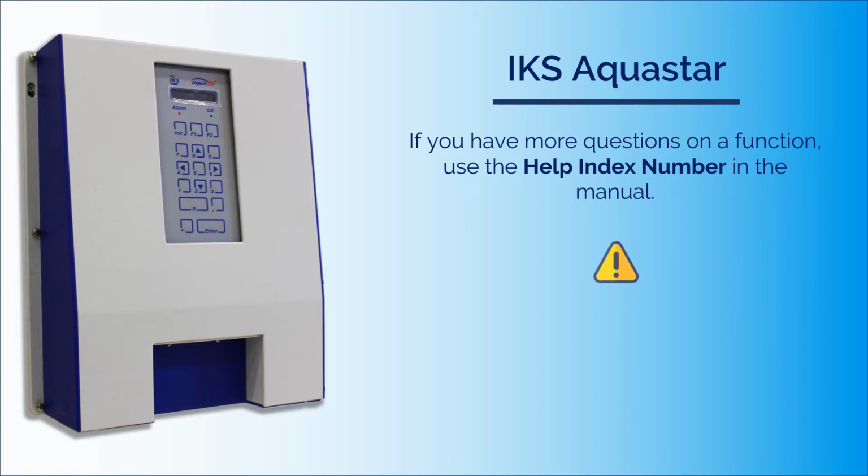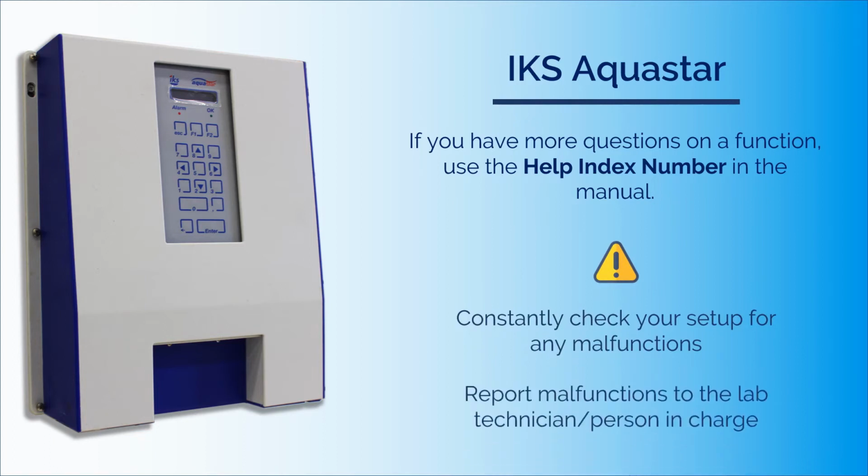Important reminder: always check your setup daily for malfunctions. If there is a malfunction in the equipment, report to the lab technician or person in charge.